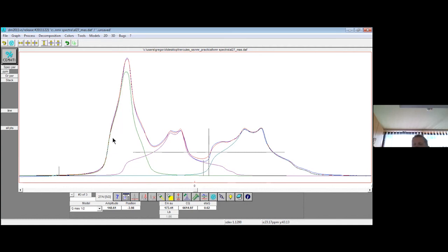And therefore also the measured line shape is not necessarily perfect, and in DMFit you can probably not get a better agreement between the experiment and the spectrum than we did right now. Perhaps we have some phasing problem as well, but still we may not get a perfect agreement. With some simulation programs like Simpson, which I've mentioned before, but this is not a fitting program in the first place. It's first of all a simulation program, so it simulates a true experiment.